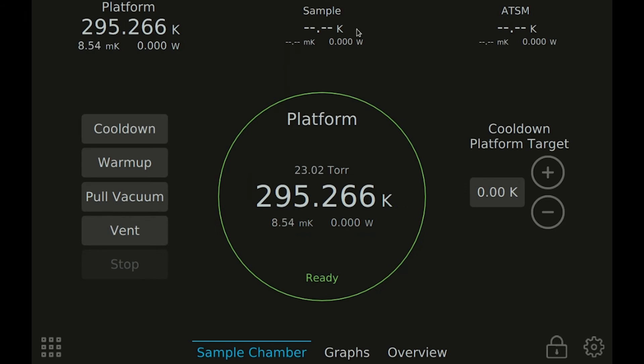If your system has a sample thermometer or ATSM installed, you will see these channels displayed across the top of the screen. Press these channels to get the controls used to operate them.